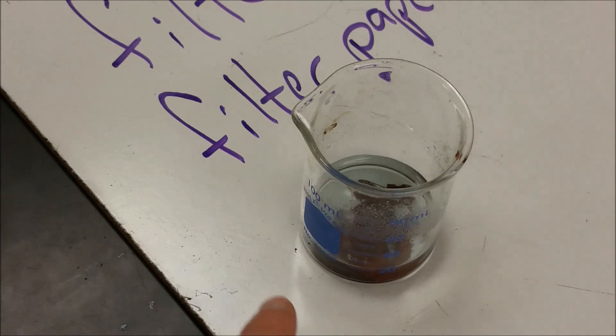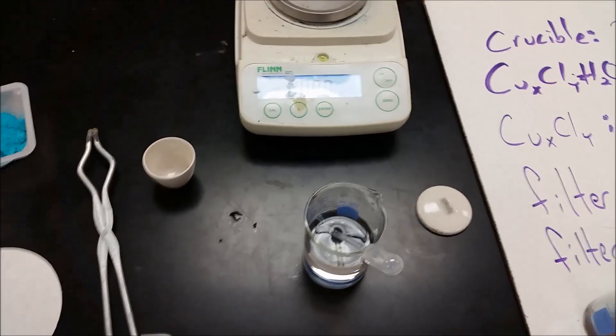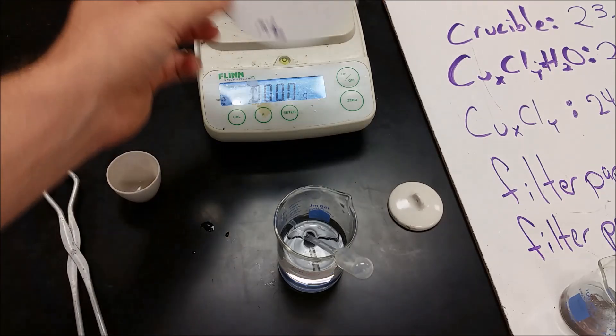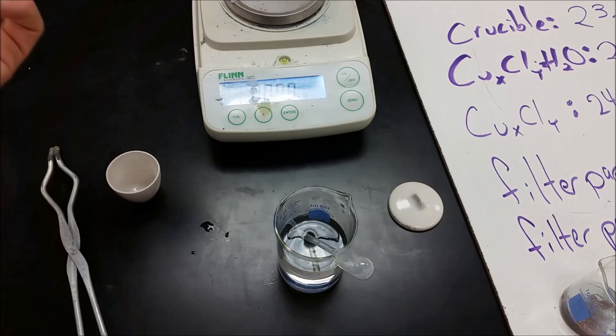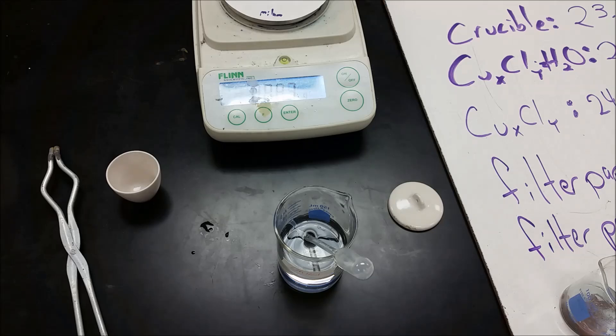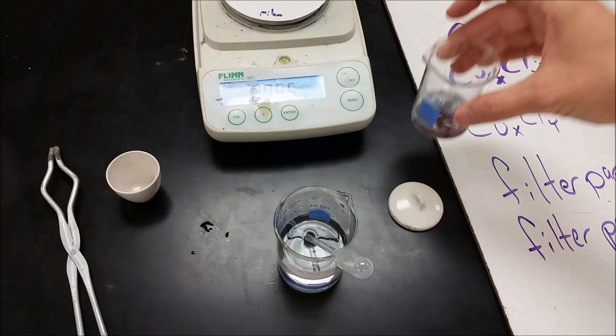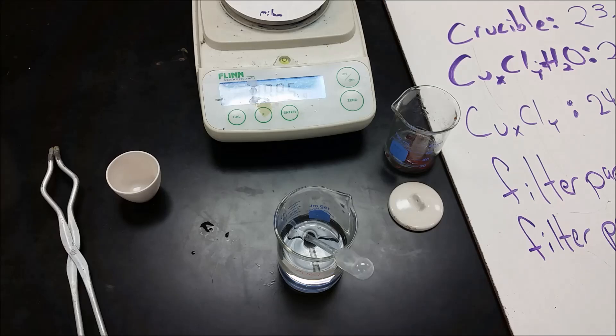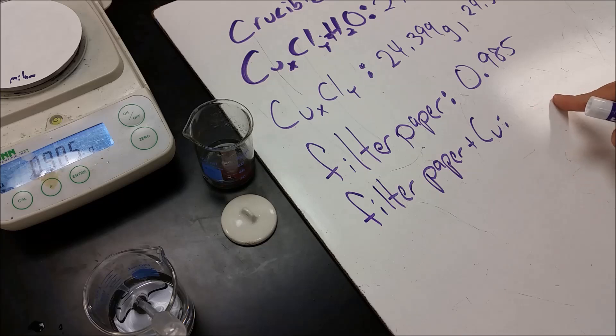We're now getting to the point where the blue color is starting to go away. Not quite there yet, but in the meantime we're going to get ready. So what we're going to do is we're going to zoom back out. And we are going to get our filtration set up ready. So our filter paper, we're going to get the mass of that, and it is 0.985, and what we're going to do is we're going to filter the copper from the solution, and we're going to see how much copper is left. When we're done, we're going to fill in what the filter paper plus the copper is after it's been rinsed and dried overnight.